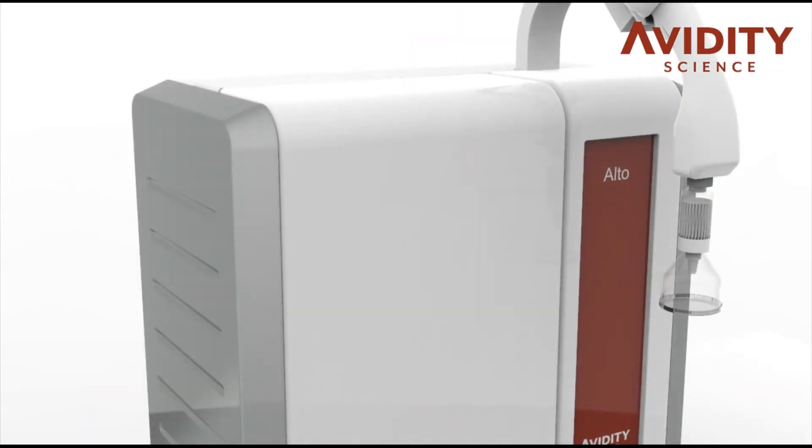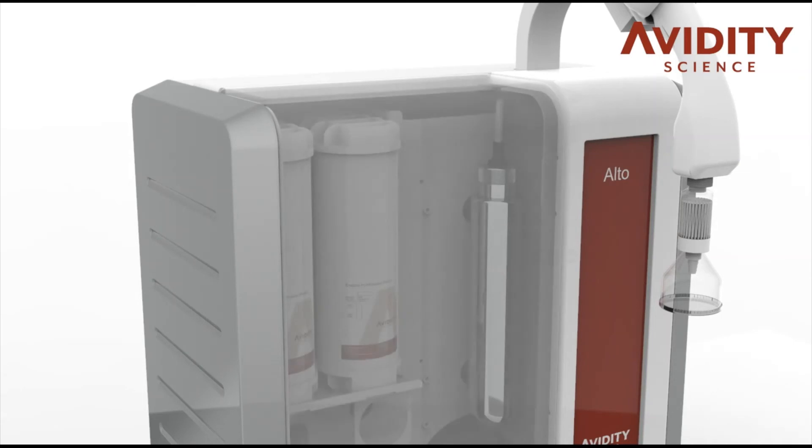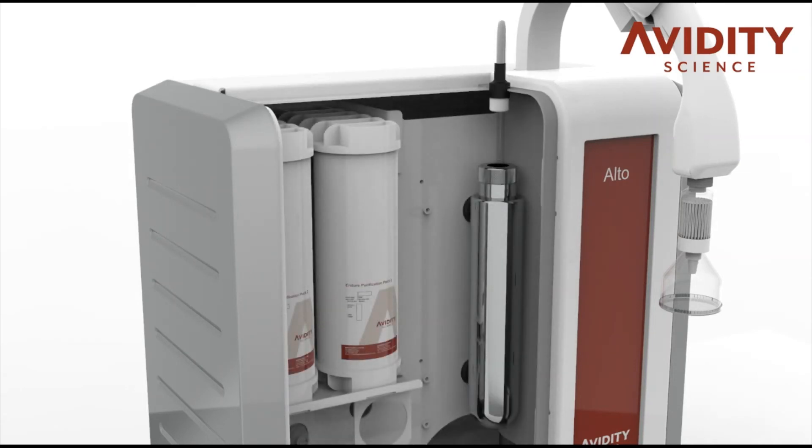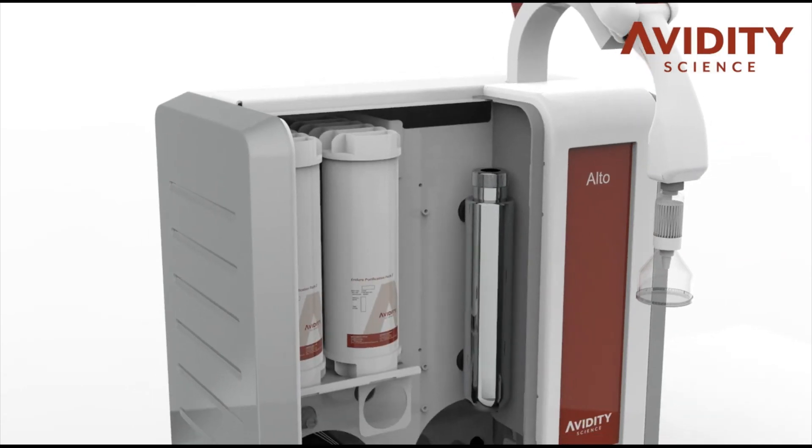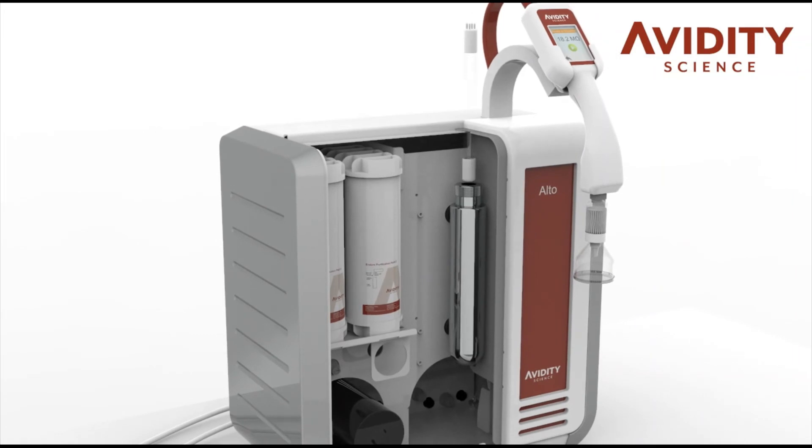To install the UV lamp, lift up the grey cable to reveal a four-pin connector. Insert the lamp into the housing and locate the pins, taking care not to touch the glass while installing.